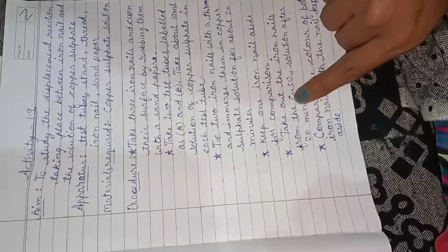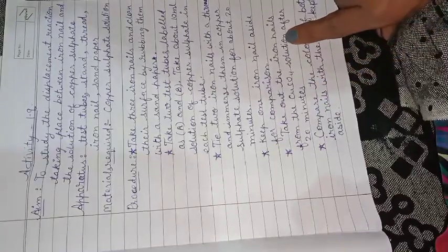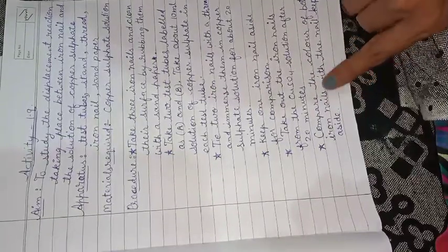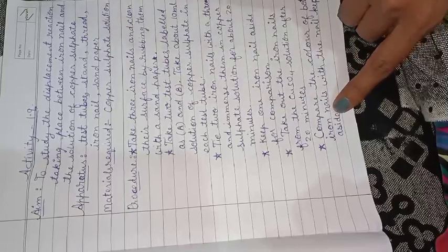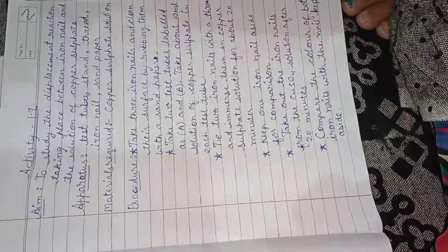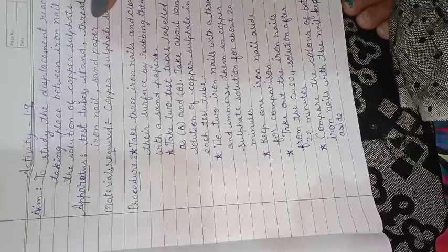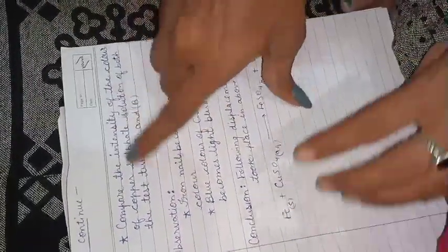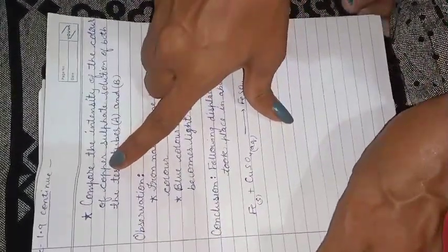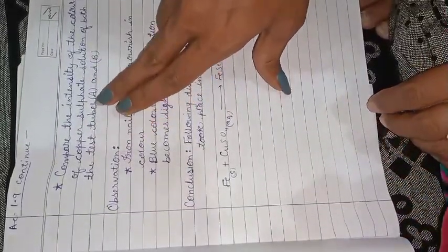Take out the iron nails from the copper sulfate solution after 20 minutes. We will remove the iron nails from that solution after 20 minutes. Compare the color of both iron nails with the nail kept aside. We will compare what change occurs in those 2 iron nails which were immersed in the copper sulfate solution. And we will also compare the intensity of the color of copper sulfate solution of both test tubes A and B.